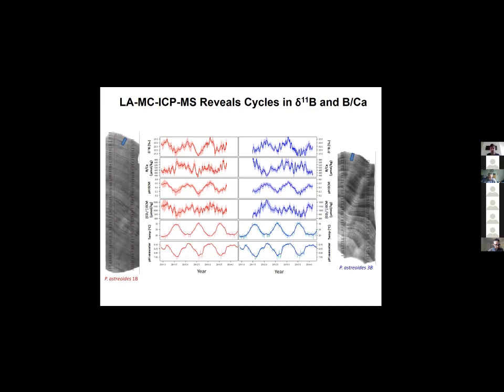And using an age model, we can plot this alongside the logger data. And it's clear that this approach will show high resolution and speedy environmental reconstructions that could be used for looking at historic trends in ocean acidification.